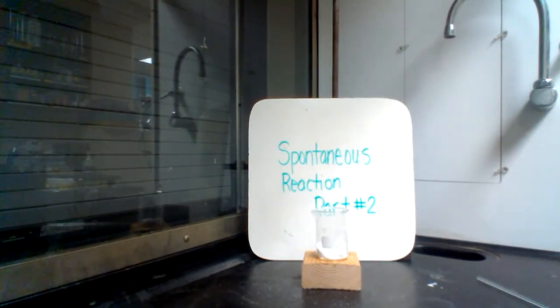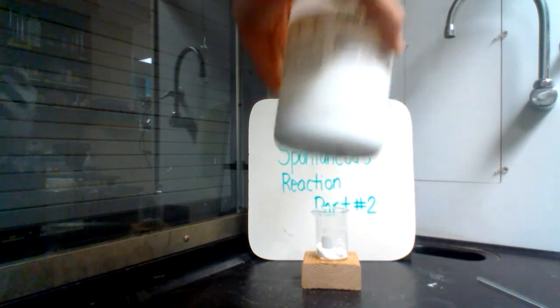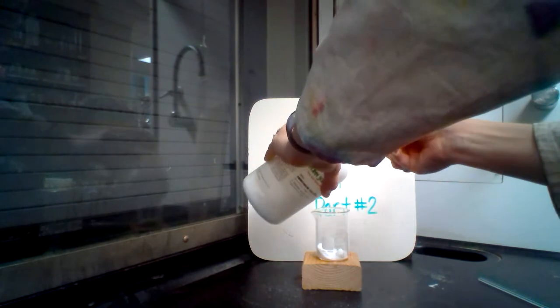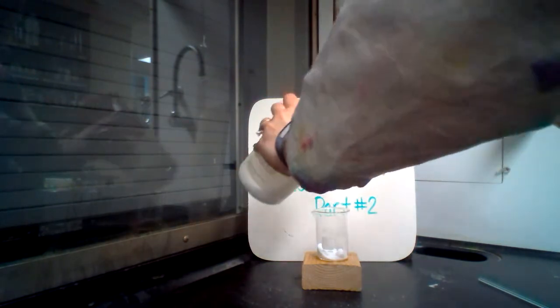Let me get another spatula out here for my ammonium chloride. Notice I'm taking my ammonium chloride now. I'm going to get some good pieces here. I'll put about 30 grams of that as well.